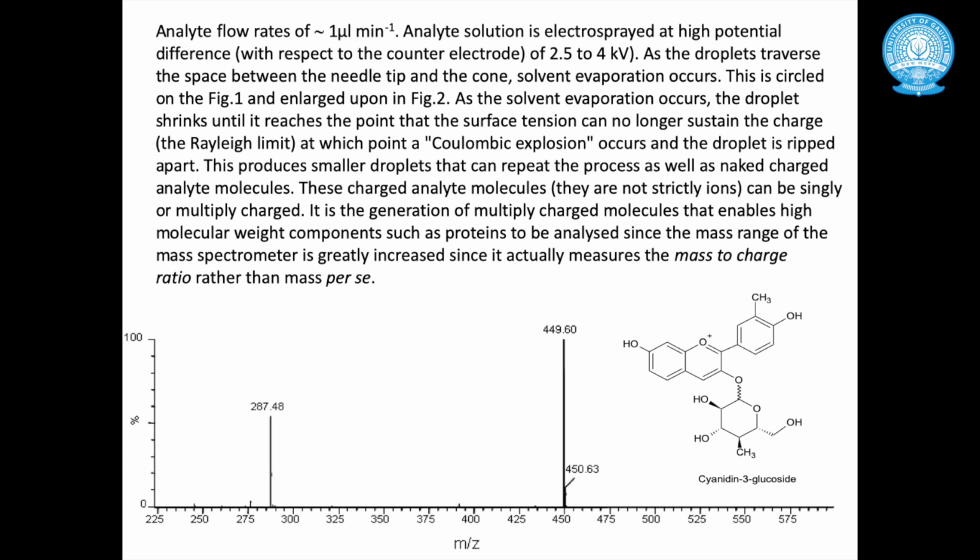So I am not going to explain NMR spectroscopy in detail here, because it is basically used by chemists, and biologists are not used to interpreting the NMR data. NMR data comes in spectra, and the spectra carry the signature of the molecule being studied.